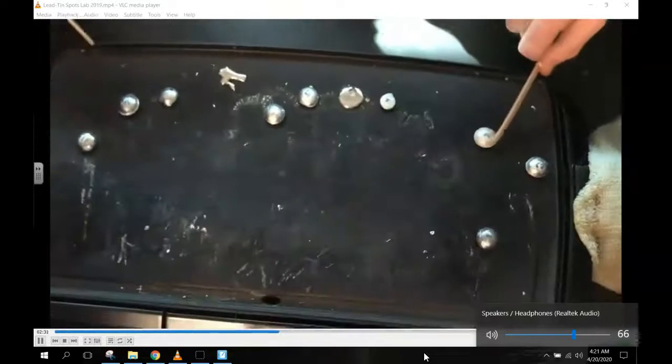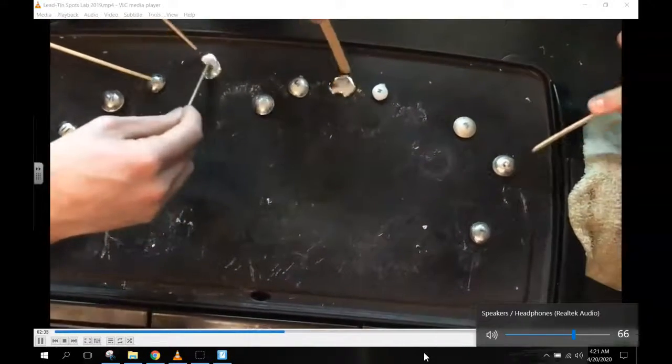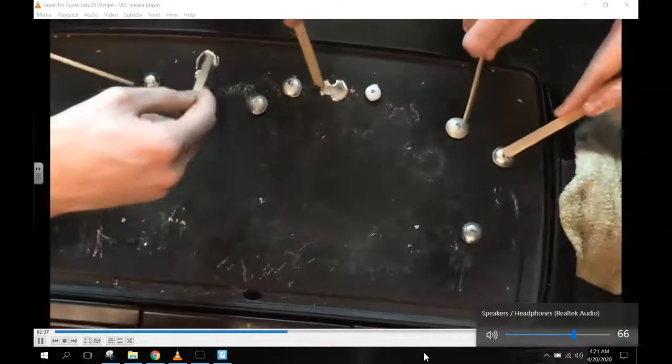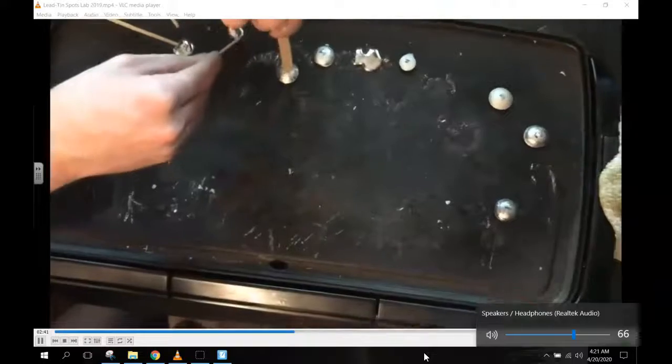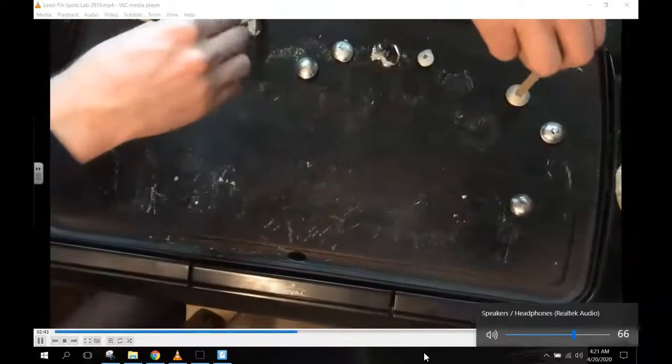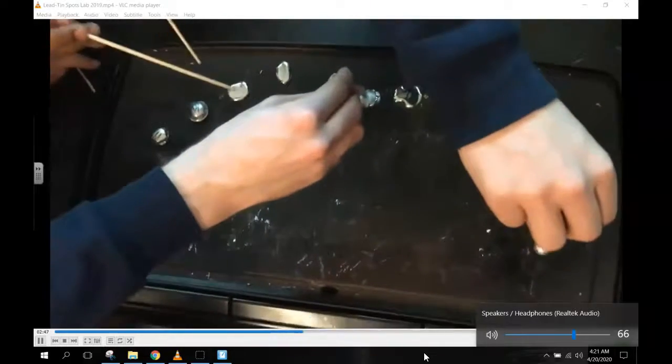Do you see something called slush? It's not a complete liquid. It looks like that one character from Fantastic Four. You guys know what I'm talking about, right? Yeah, okay. Stick your finger in there. Mine's nothing. 9 started. Why are you touching mine, Dylan? Which one's yours? 9. Oh, look at that!